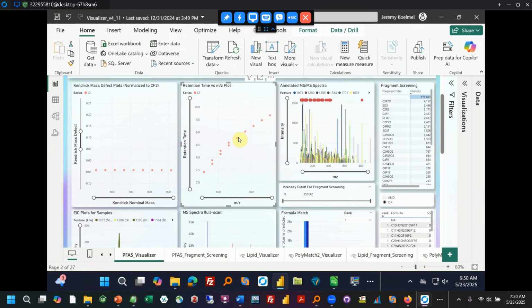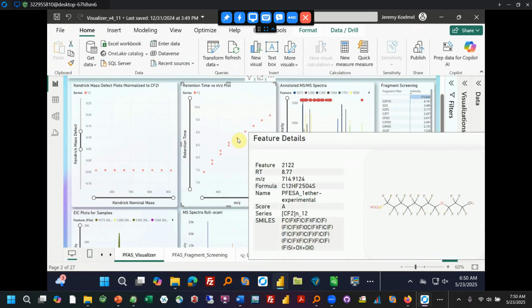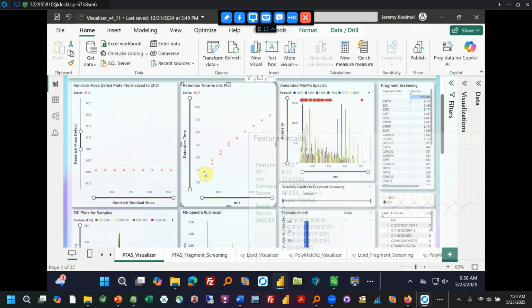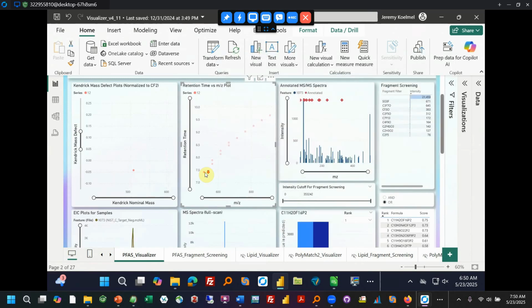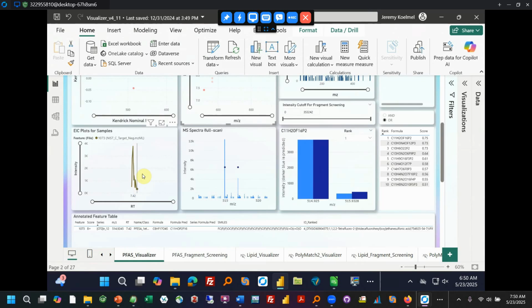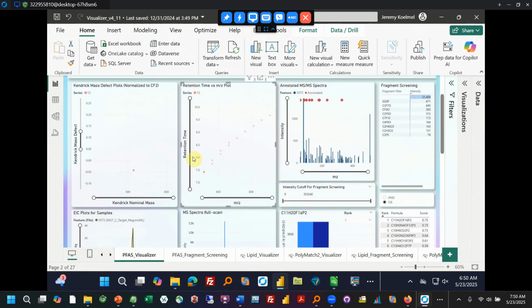Did want to show one thing here, which is here's an ether species. Let's again look at the lowest one. It can often be easier to confirm. So if I click this species, here's a peak. It's actually pretty low in abundance.